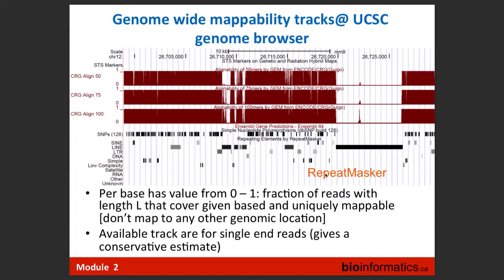There are several situations when it's important. For example, I study one genome, one particular sample, and I'm interested in an absolute answer. I really want to see where on the genome enrichment in my ChIP-seq library happens and where it doesn't happen, and I then draw functional conclusions out of this. And sometimes I see lots of enrichment, and then I have a disappearing of enrichment. I have a hole. And I can say, wow, so here something happens.